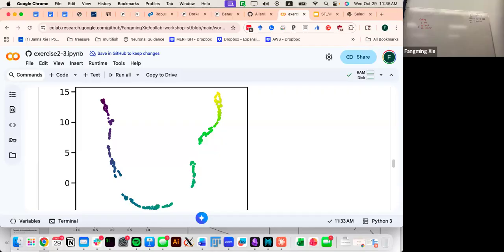Within the square bracket, they wanted to specify like an Excel sheet. They wanted to select first the rows. So you want to select all the rows. The way to do that is just to put in a colon, then comma, zero. They start from 0. And this is comma one. Yeah, because I forgot the UCS and it had a line underneath, and I just forgot to add those.